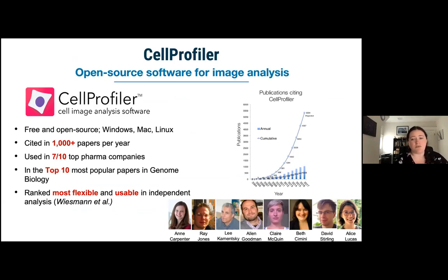The software is free and open source, and what I think makes it special is there's always been at least one biologist and one professional software engineer working together on the code base, which means you have the luxury of the expertise of a professional software engineer to make it very high quality. But you also have input from a biologist with microscopy training who understands how biological images work, who understands the kinds of things that biologists do and need and what we call things. And so in that sense, I think that's partly why the tool has been around for as long as it has. In software terms, it's pretty ancient.